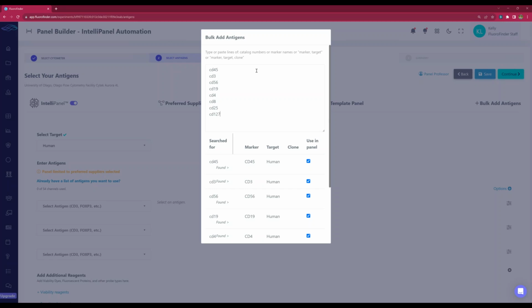Also, what I didn't show you was that right below selecting your institution, you can choose a generic filter or a generic instrument. Any that are commercially available should be on there. And if you don't see a configuration that someone regularly uses, you can add it. We don't really care what the configurations are in there.